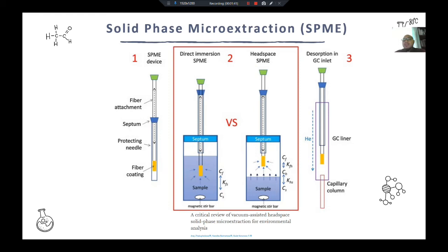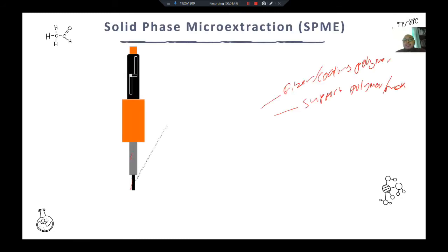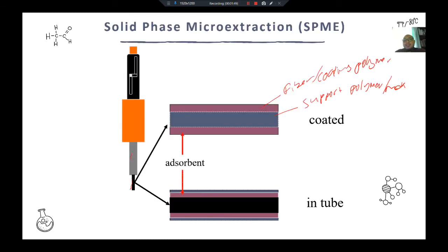So usually we hide it inside this particular tube. The tube is sharp on the outside, so the tube is what will penetrate. After that we can push out the fiber, which will get heated. Okay, right.